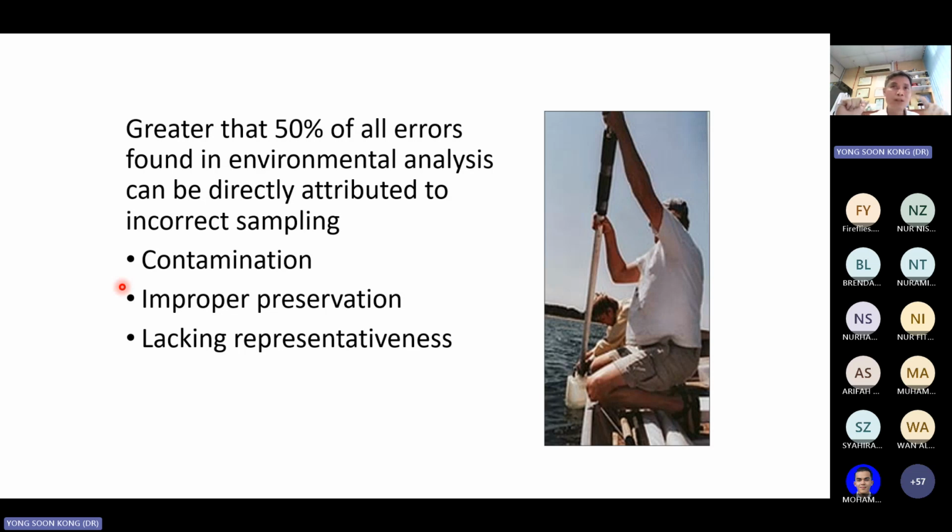And also, ammonia, even though it doesn't change, if you forgot to put sulfuric acid, the sulfuric acid may not capture the volatile form of the ammonia, so it might also escape. So these are the things that preservatives can do to hold your analyte, and also some preservatives might kill microbes that change the water parameters. Okay? So there are a lot of things. And of course, like I told you in the earlier tables, be mindful. And also the last one, the lack of representativeness.